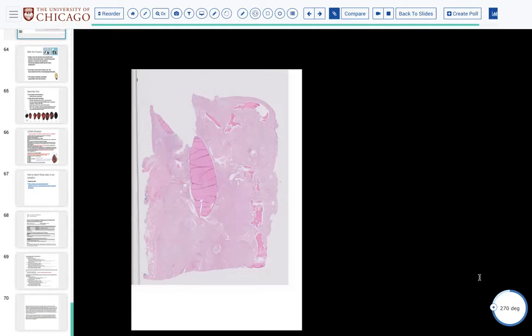When we are not sure, when we put the eosin, then on the slide, sometimes we don't get to know whether the tissue has been exposed after cutting deepers. And after staining, we see that there's no tissue. So sometimes this eosin gives a false impression that the tissue has been exposed, and getting the tissue.